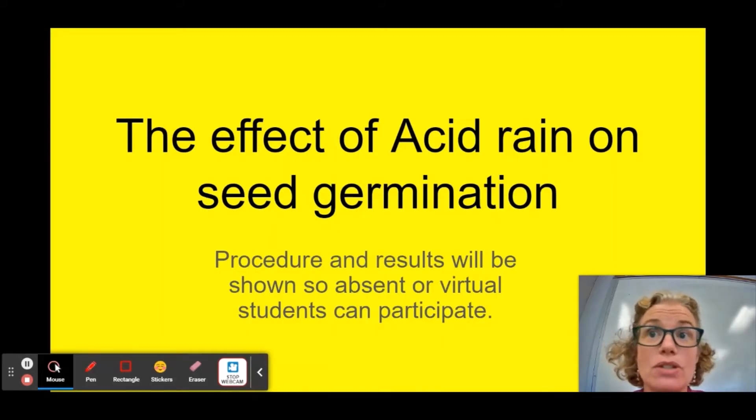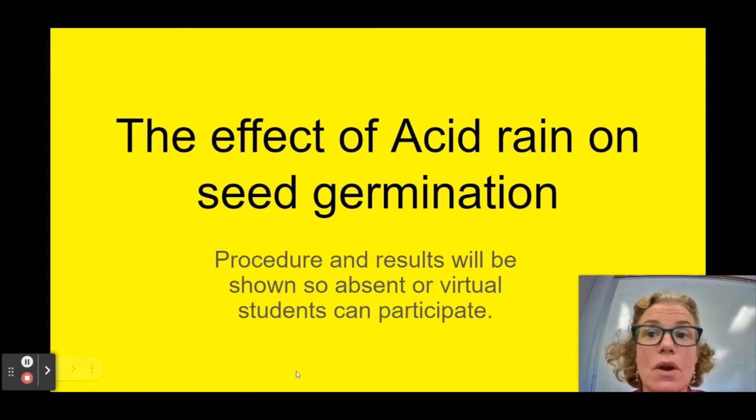Hi everyone. Today we're going to do an experiment where I'm going to basically act as your lab partner as we investigate the effect of acid rain on seed germination.